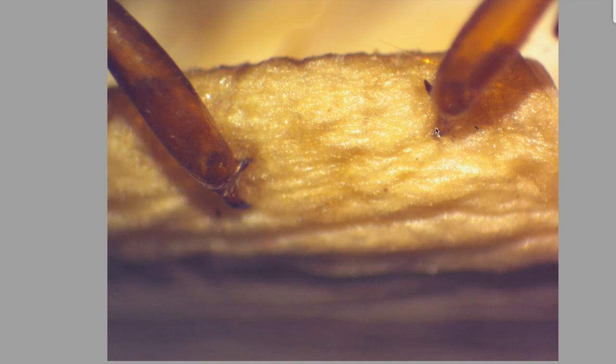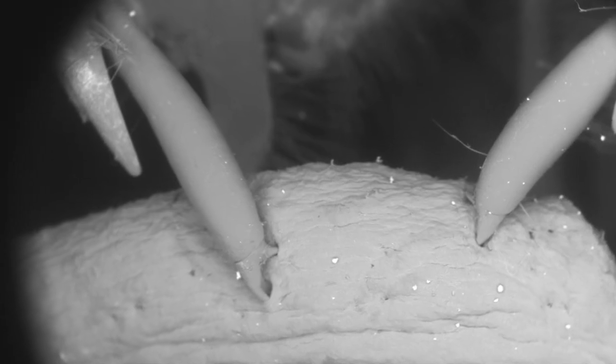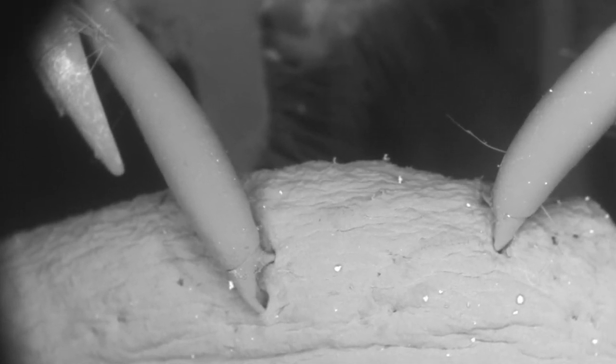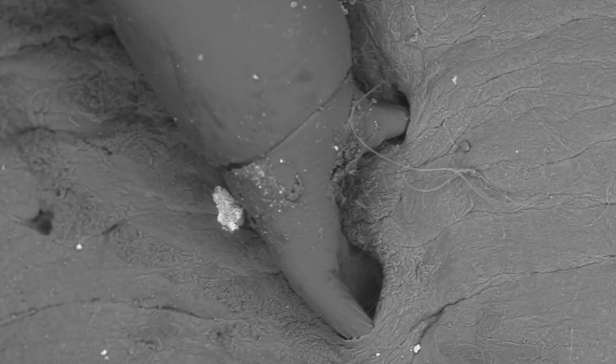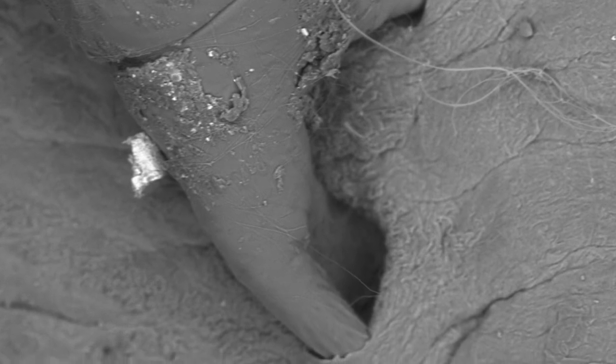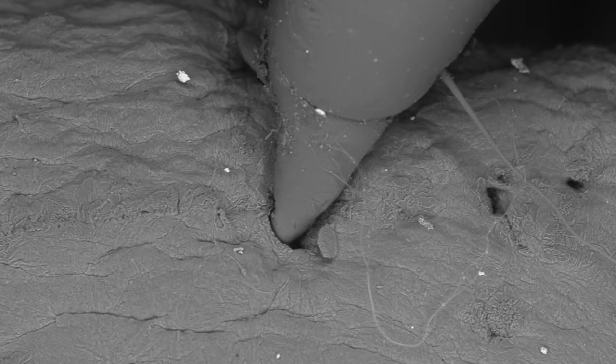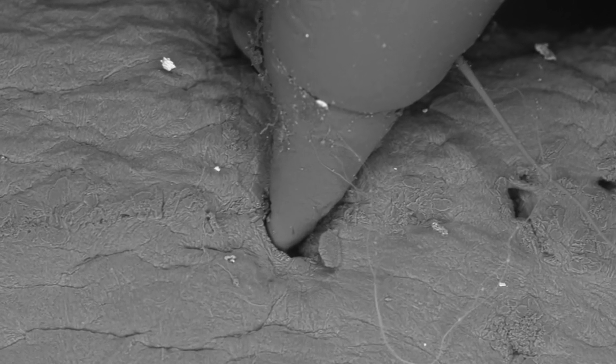You can see it actually puncture in there. Oh, I can't wait to put this in the SEM. It's going to be so cool. Oh, we're at 30X. Yes, I did put it in the SEM, and I saw some really cool things. I'm going to be sprinkling the pictures probably at the end of all of this, but I wanted to put the claws in here just so that you could see them stabbing into the material itself. It's just so cool.